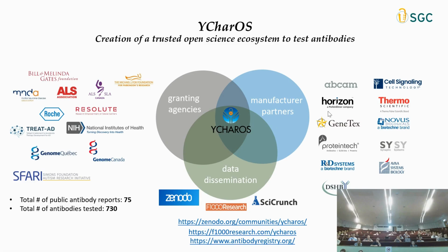And so we either obtain knockout cell lines or we create the knockout cell lines as needed. That's based on various approaches to trying to find human cell lines that express the protein of interest. Then we take the wild type and the knockout and we do the immunoblots, the immunoprecipitation, and the immunofluorescence. And all of that data is then presented to the partners in monthly meetings of our board, which we call the crack. And so many of the people around this room are on crack.